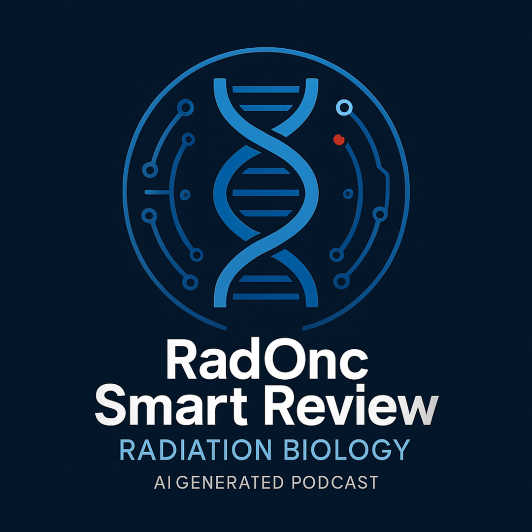Okay, let's shift gears to another set of foundational techniques, the blotting methods, used for detecting specific molecules: DNA, RNA, or protein. Right, blotting techniques are classic. The basic idea is you separate molecules by size using gel electrophoresis, then you transfer them, that's the blotting part, onto a solid membrane, and then you use a specific probe or antibody to find the one you're looking for in that complex mixture.